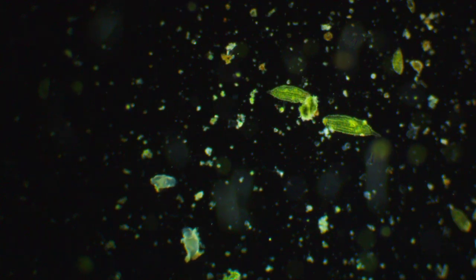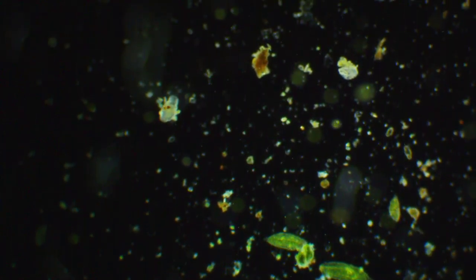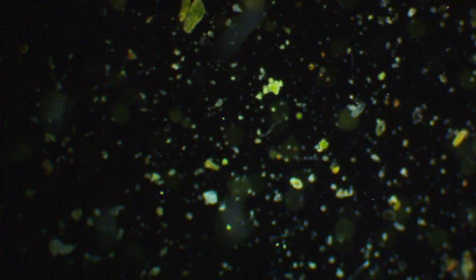Got 3 rotifers here. 2 now. This guy over here. What else is in this drop? Man, there's rotifers abound.